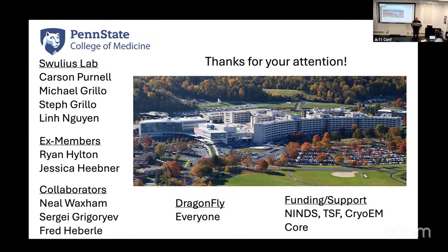But yeah, all patch-based. So far, I think all of this would be improved by 3D networks, but currently in Dragonfly, the way that they implement 3D training, and I've done a lot of it, it's just time consuming is all I mean. The trade-off isn't worth it at this point for us.